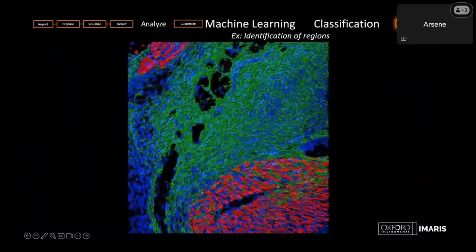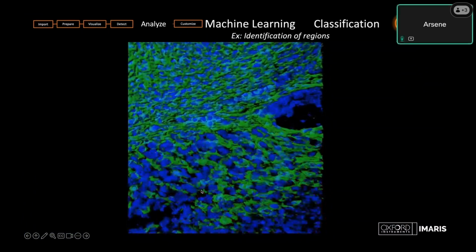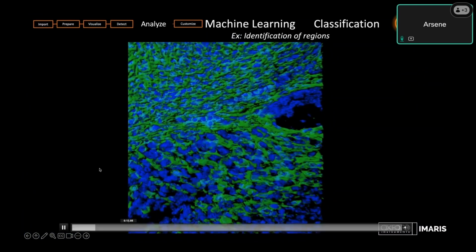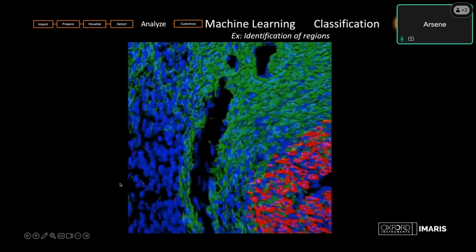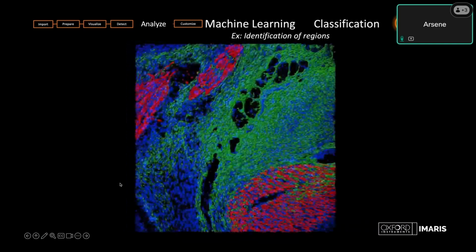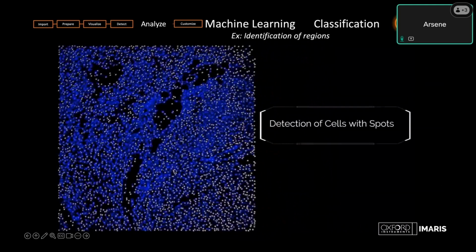So finally, in this plant cell image, there are three channels describing a multi-regional landscape. However, each region can hardly be described only using channel colocalizations. Probably each region can be described by its own texture, local and environmental channel intensities, and other unknown descriptions. Here, at a glance, we could manually define these regions without really understanding what is going on. So in this situation, the new IMARIS machine learning classifier will enable us to quickly and easily classify all cells per region.